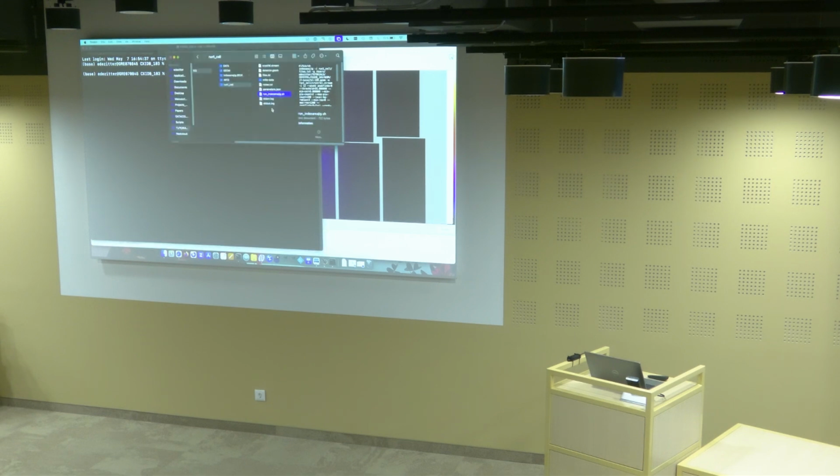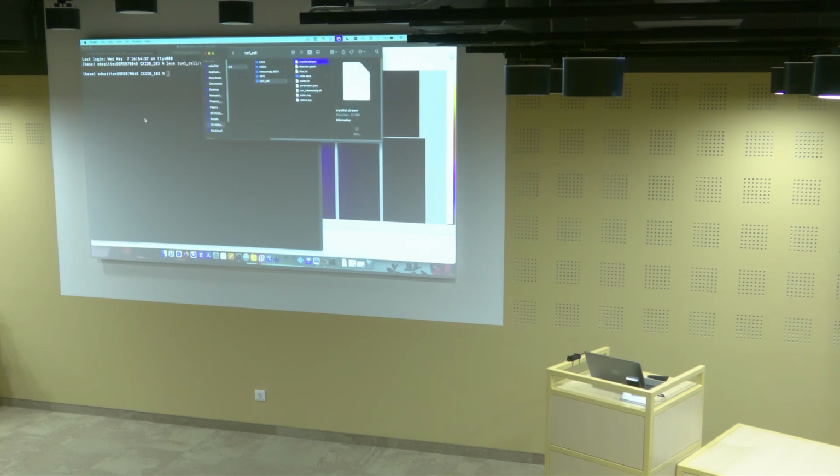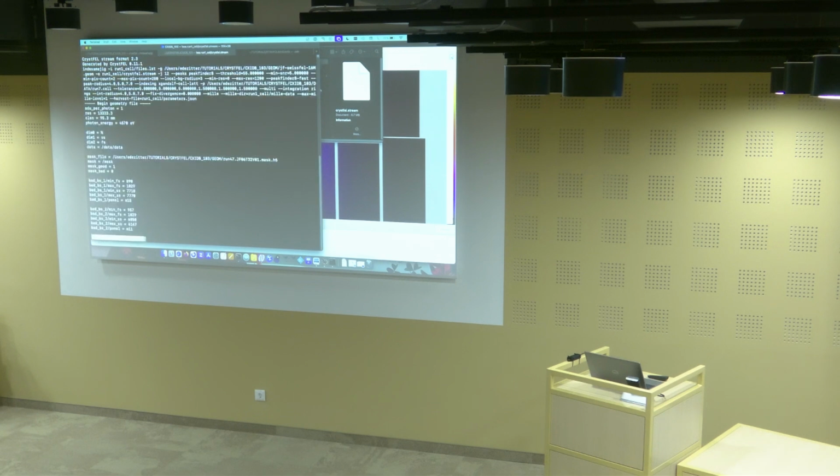Yep. And then we have some log files. But then the first file that we had here is the crystfel.stream. So that's the main output file of CrystFEL. So that's interesting also to look at. So while this is running, we can have a look at what is in this file. So again, we look at what's in this file. So this is actually a very long file. It's just plain text.